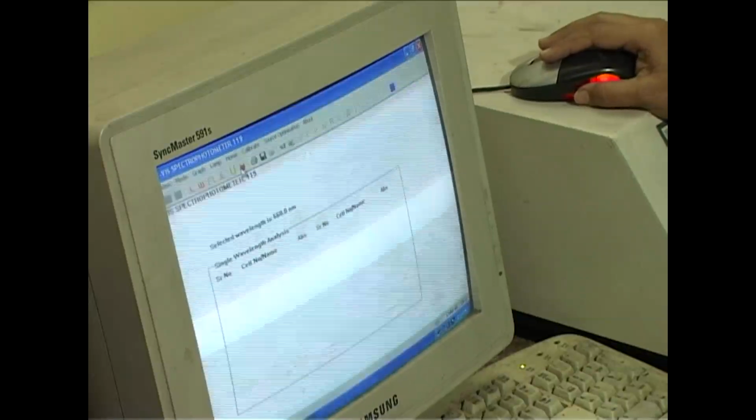0.6 at 600 nanometer. Ma'am, why do we add CaCl2 in the media? The presence of divalent cations helps in the adsorption of the T4 to the bacterial host. So, it facilitates the adsorption of the bacteriophage to the host and penetration of its genome.